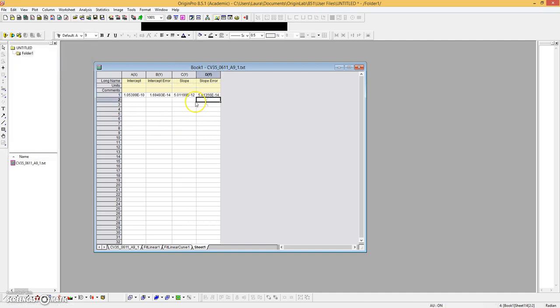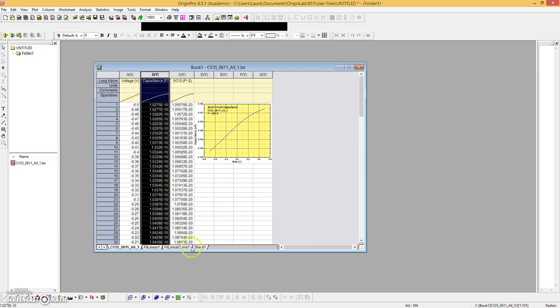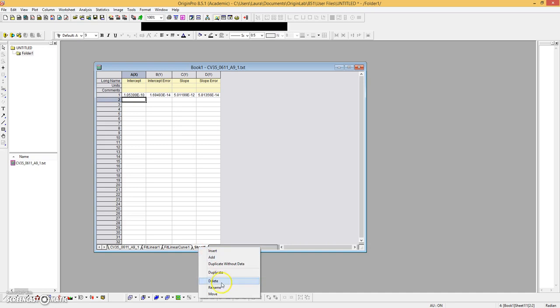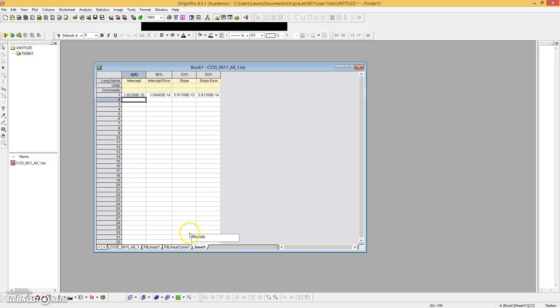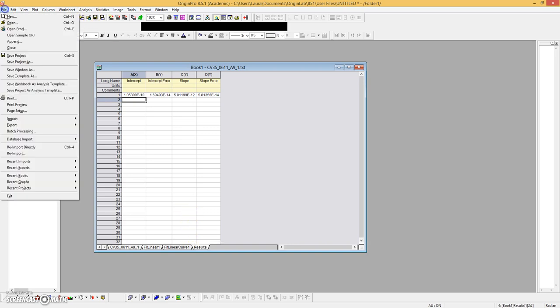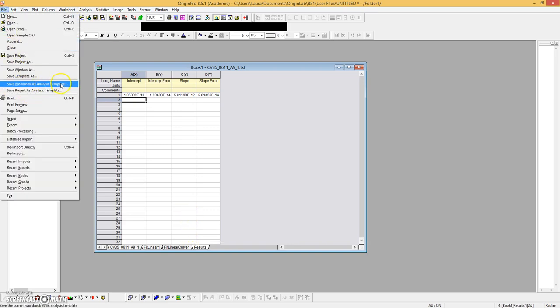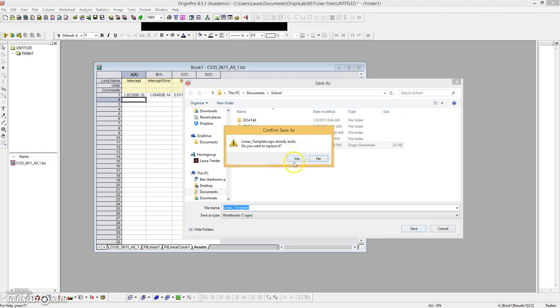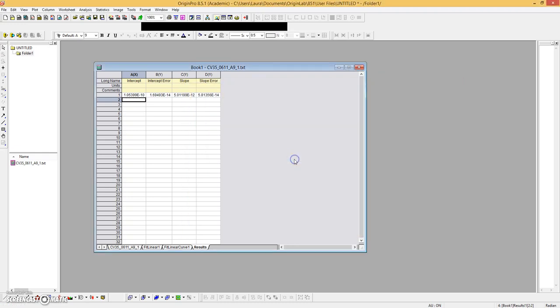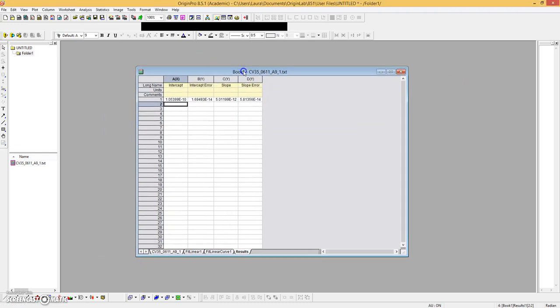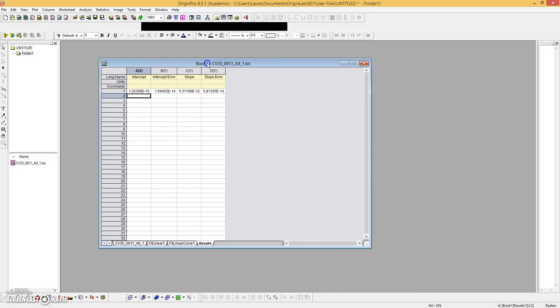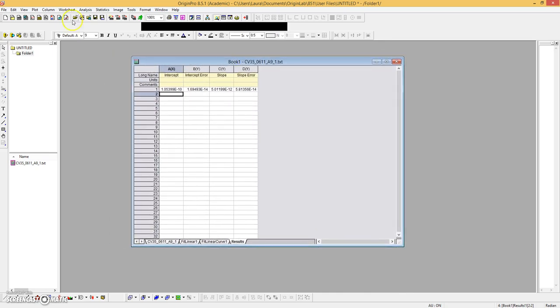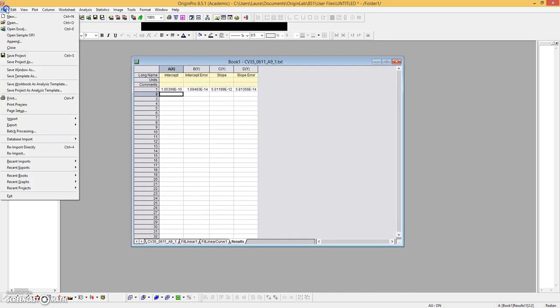And so now we have the theoretical output of whatever analysis that we just did. And now let's say we want to do it four times. Oh, let's rename this and call it our results. That's helpful. So now we're going to save this file. Okay, we're going to save the workbook as an analysis template. So let's go ahead and do that. I'm going to write over this linear template. Yes. Okay, so now we have the template done and let's do some batch processing.